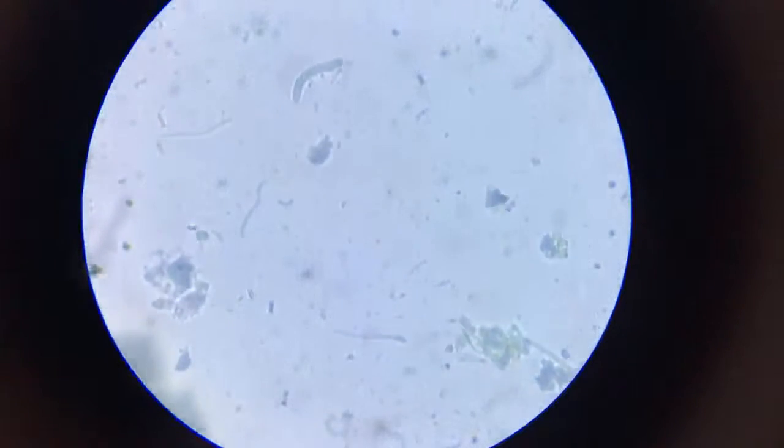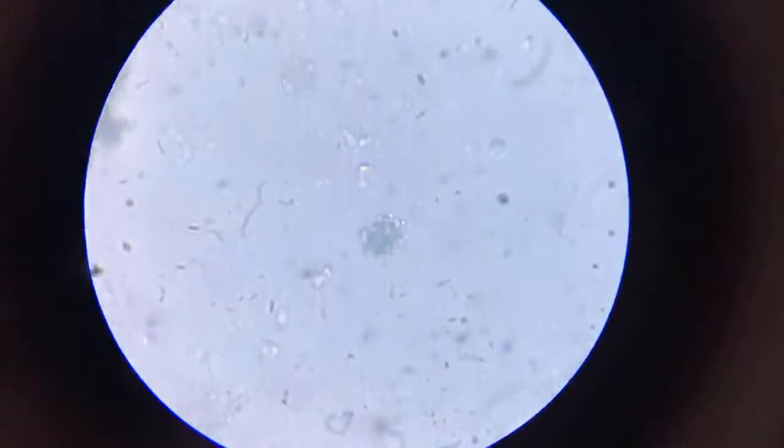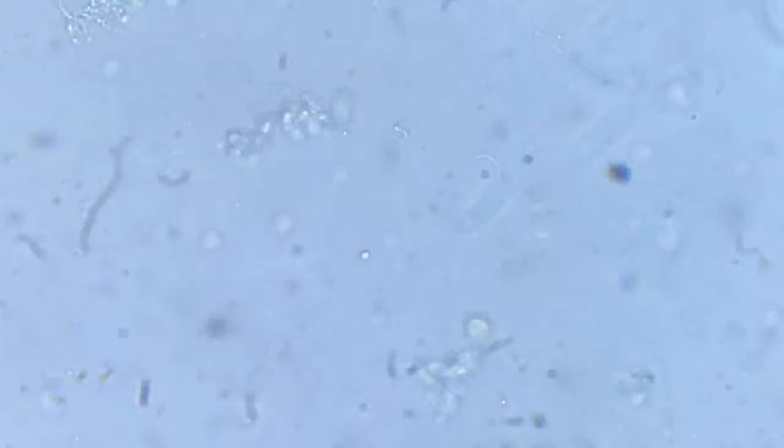These are bizarre worms, and my best, wildest guess is that they could be something related to the guinea worms. But as we know, the guinea worms are no longer prevalent. So there could be something else.